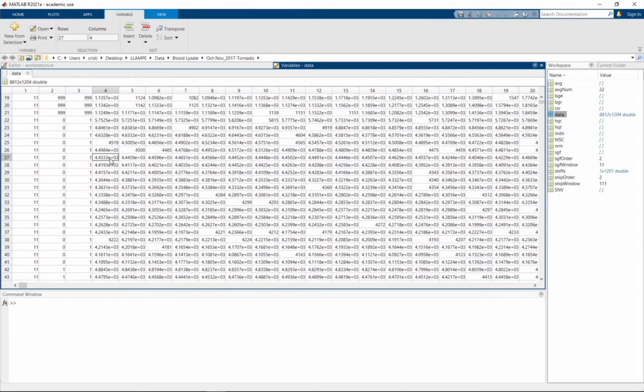Now, obviously, 1,200 different variables or axes or dimensions is really hard to visualize and hard for us to interpret. So PCA tries to reduce the number of dimensions down to just 2 or 3 or maybe a few more. But the point is that we're reducing the dimensionality of the data significantly. So instead of plotting this spectrum using 1,200 different axes, you might be able to get away with just 3 axes or just 2. And that way you're able to interpret your results a lot better.